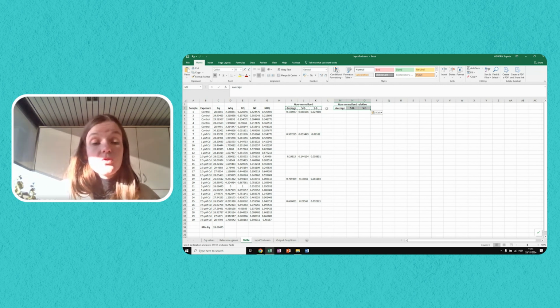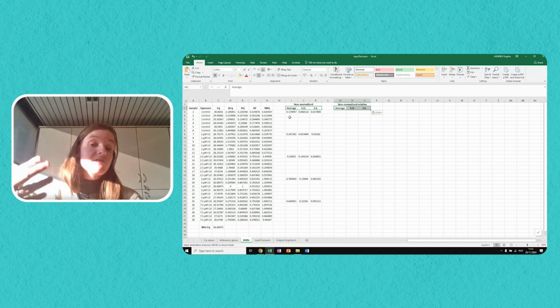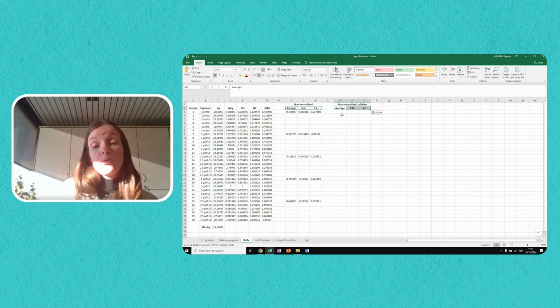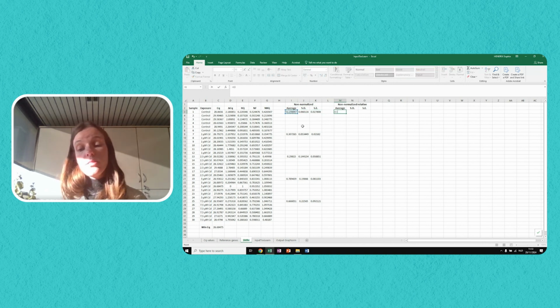So what I want to do is convert this first value, so the average of the control condition, from 0.17 to 1, and then express all the other values relative to 1. Or instead of 1, you could, for example, also use 100, and then the values would be expressed as percentages. So what I will do to convert this value into 1 is divide the value by itself.